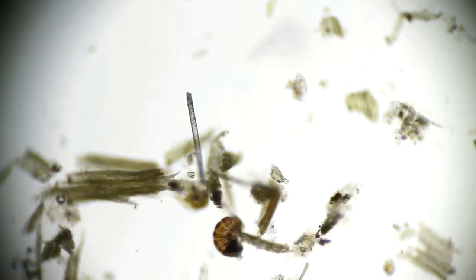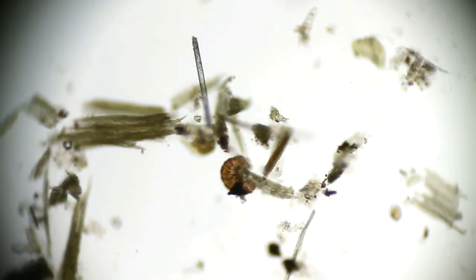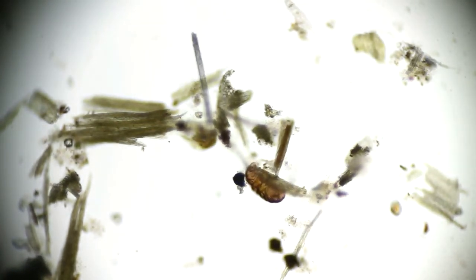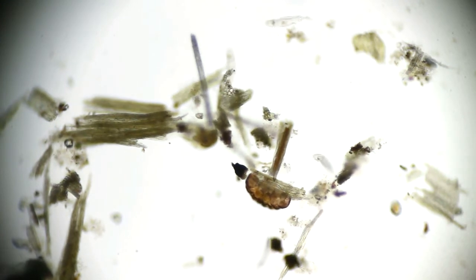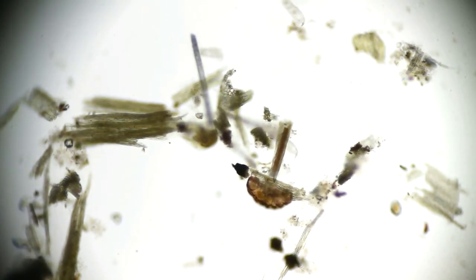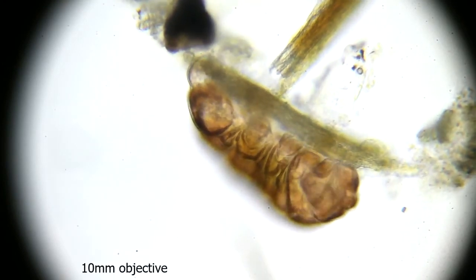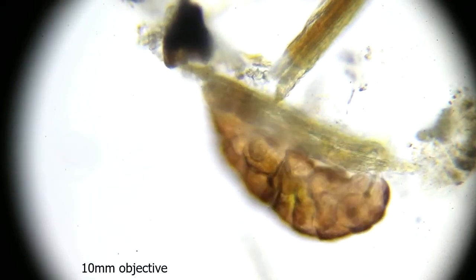So as they're wiggling around, it's really, really hard to have the whole organism actually in focus at any one time. So apologies for the focus changing, but I was having to just keep moving back and forth through the plane of focus, hoping that we'd get little glimpses of the hooks on the feet and stuff like that. There's a couple of different objectives I was using here, so I'll stop talking and just let you watch the footage of these adorable little guys.